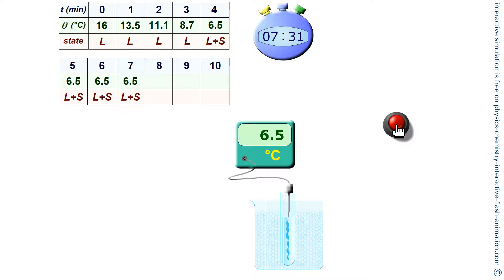All of the cyclohexane will now switch to a solid state. It is done. There is no longer any liquid cyclohexane. Yet the temperature is still positive. We can already notice this, whereas if it was water, we would have had to wait for 0 degrees Celsius.